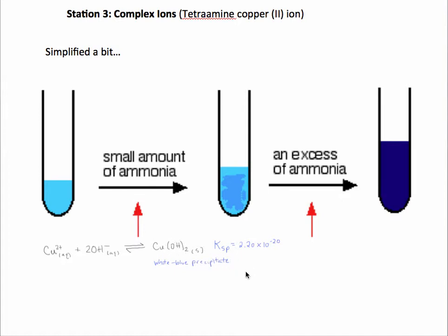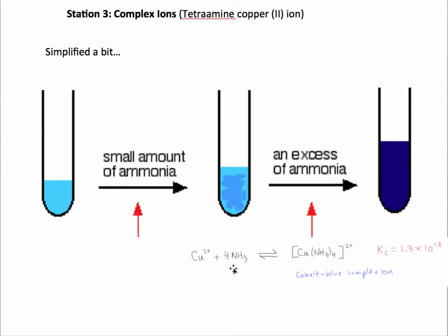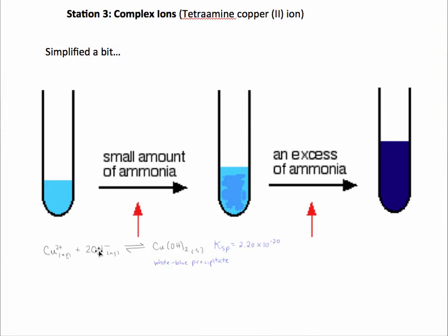So as soon as you added even just a few drops of ammonia, you readily noticed the formation of the precipitate. Now, what you also probably noticed was that in addition to the precipitate, you would form a little bit of some very deep cobalt blue solution. But when you mixed it, the majority of it reverted to the precipitate. And here's the thing we have to remember. When we first added the ammonia, the system was responding to minimize the hydroxide by the formation of this precipitate, which is highly insoluble, so it did a great job of removing it.